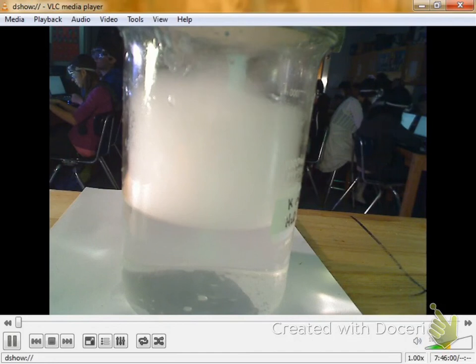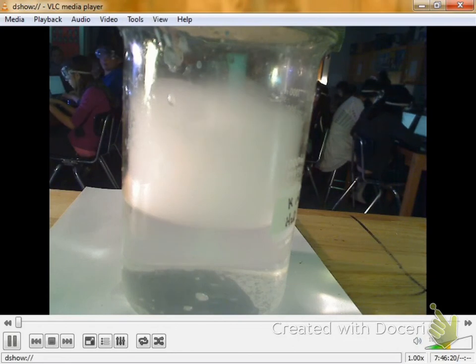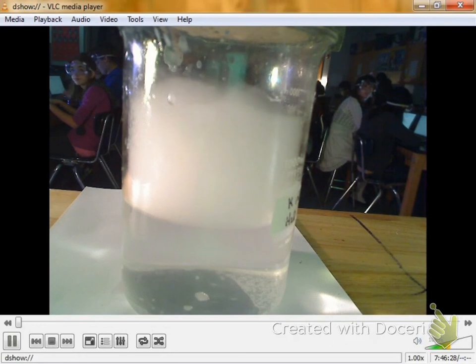How long did it take for potassium to catch on fire? A few seconds. How long did it take sodium to catch on fire? 30 seconds. So even the second piece, where I made a big one and mushed it out, it didn't just catch on fire right away. It reacted with the water right away and started fizzing, but it didn't catch on fire. That potassium will catch on fire just about as fast as it falls in there. Notice I didn't stand next to it. There's a reason why I'm not standing next to it, because I don't want it doing all that stuff on me.